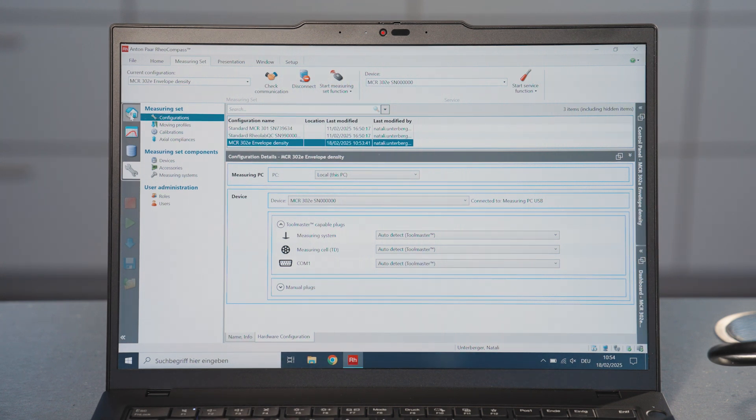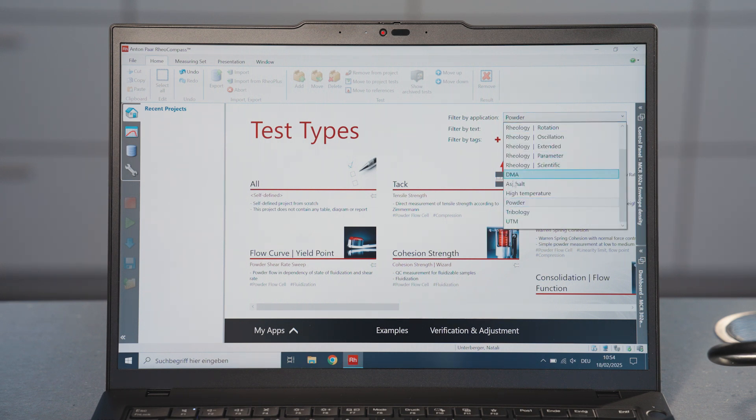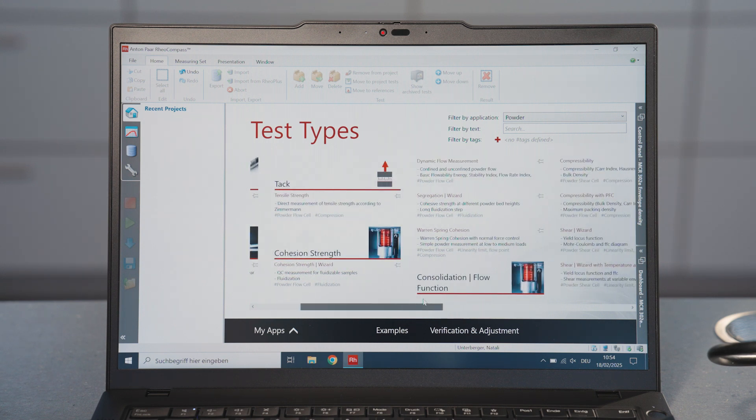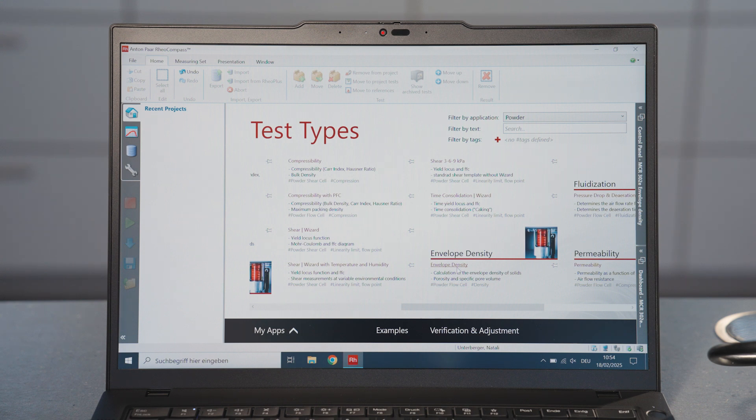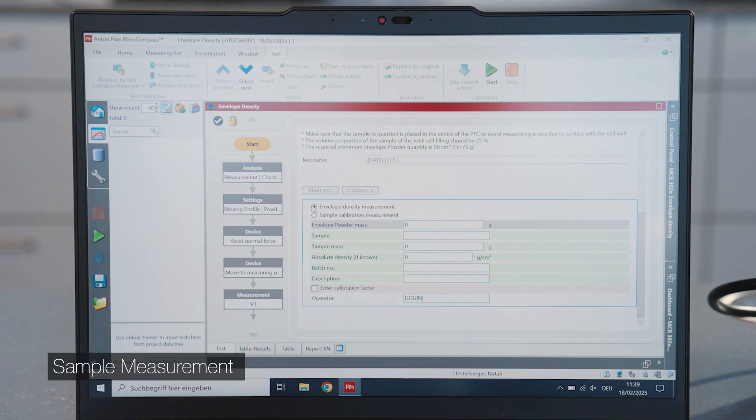Navigate to the Ribbon on the left side and click the My Apps icon. Create a project file by selecting Envelope Density in Anton Paar Apps. Select Envelope Density Measurement on the Start screen.